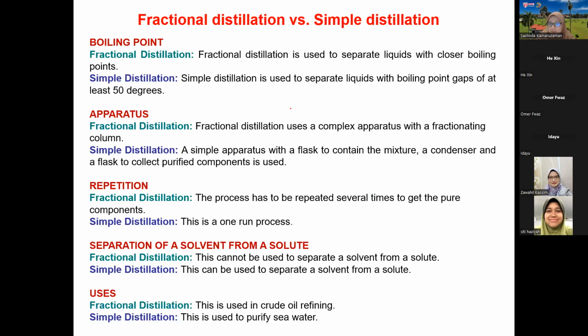So I think we already discussed in much further detail about distillation and fractional distillation. At least we have an idea what the differences are. In terms of boiling point, for example, you can know that when the boiling points are closer, you should use fractional distillation.